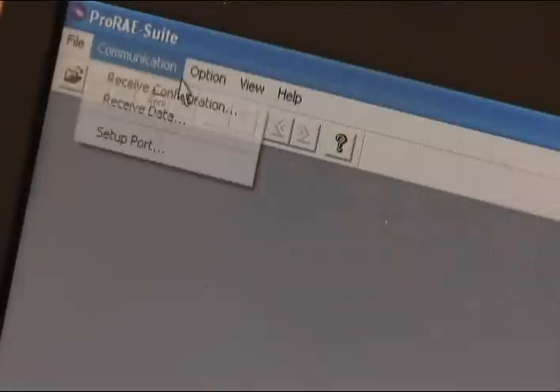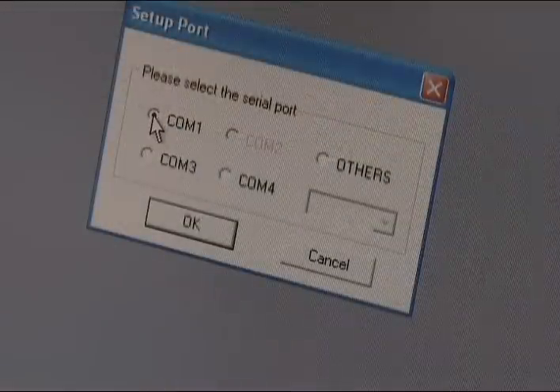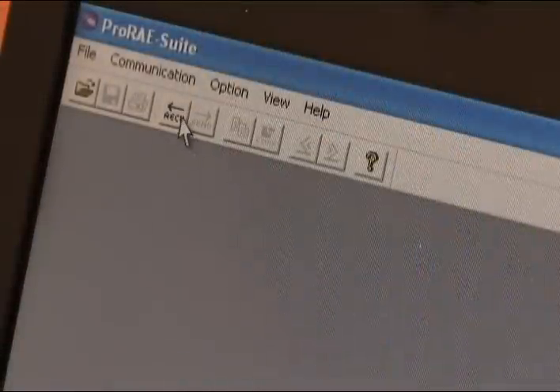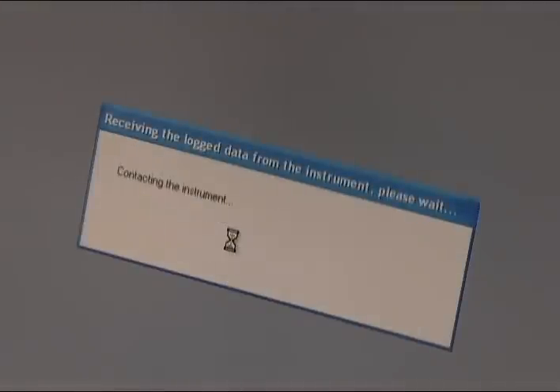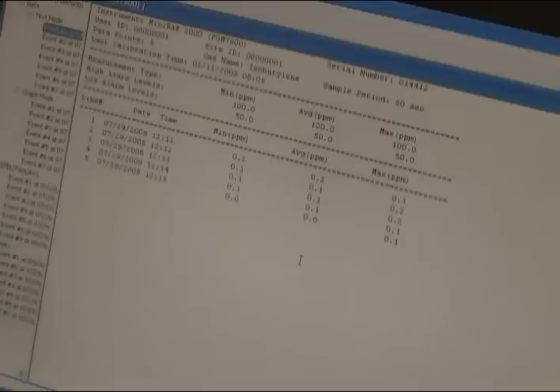Load the software CD and follow the online instructions. Open the communications tab under the toolbar, set up port and select COM port. Press the RECV icon with an arrow pointing to the left under the communication tab in the toolbar. Click OK and data will start to be downloaded. When data transfer is complete, the report will open up so you can save, print out a copy, or import to another document.